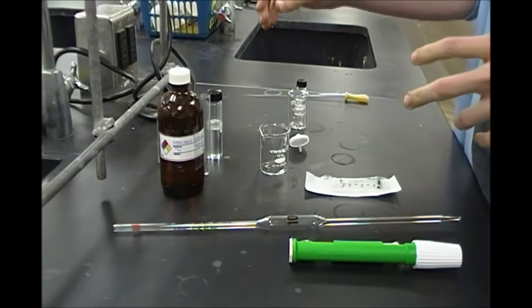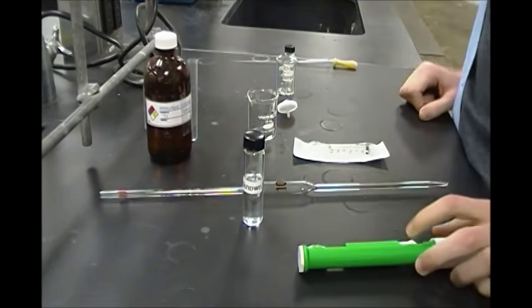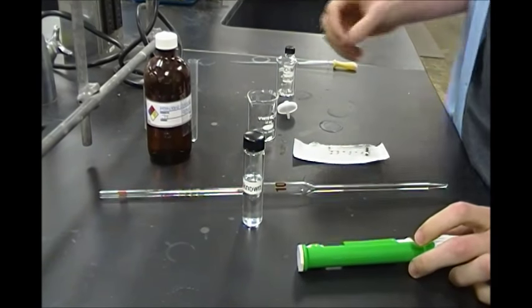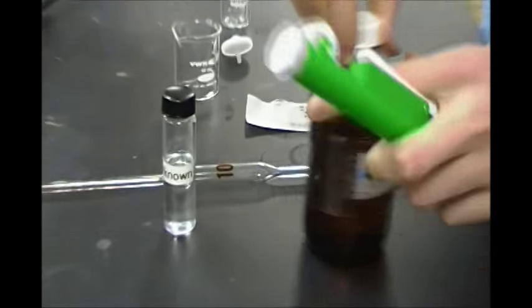What we're first going to do is take some of our unknown, and we have to dilute it because it's way too concentrated right now. So we will dilute it in our solvent, which is going to be Methylene Chloride.